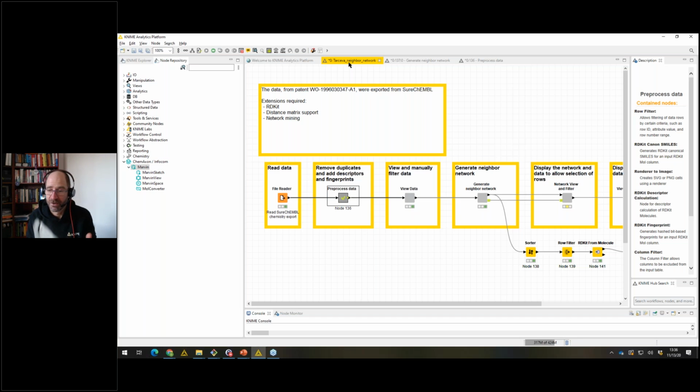So we have about 100 rows here. If we go to 1,000 rows, it's going to take 100 times longer, right? If we go up to 10,000 rows, you can do the math. It goes up really quickly. But that's not a limitation of Knime. That's just if you're using an n squared algorithm, when you increase the data size, the runtime goes up.